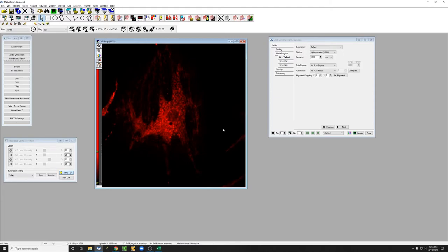And if we were worried about speed, this is a way of speeding up our acquisition. So it's a quick way of losing resolution but gaining sensitivity, and you can use this on either camera.